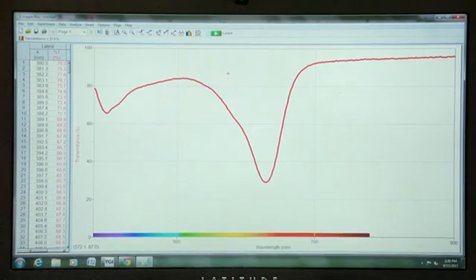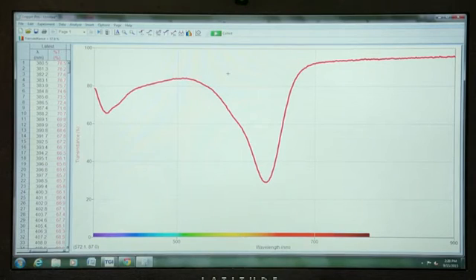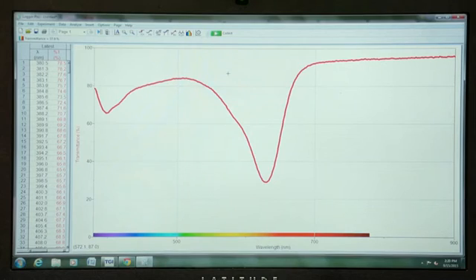An area of the graph where the percent transmittance values are very low is a region that is very helpful to identify for the analysis of samples to determine the percent of Blue 1 food dye.